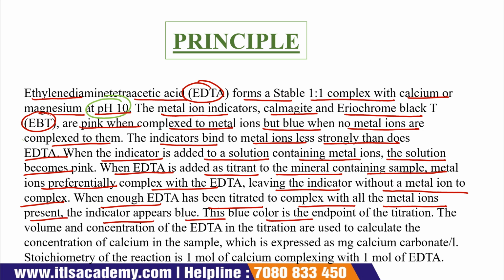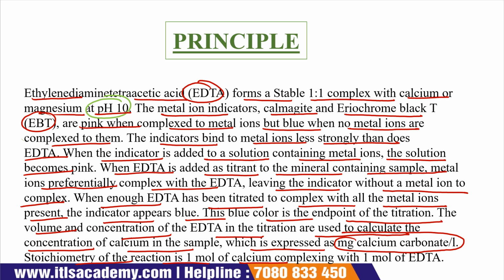This blue color is the endpoint of the titration. The volume and concentration of the EDTA in the titration are used to calculate the concentration of calcium in the sample, which is expressed as milligram calcium carbonate per liter. Stoichiometry of the reaction is 1 mole of calcium complexes with 1 mole of EDTA.